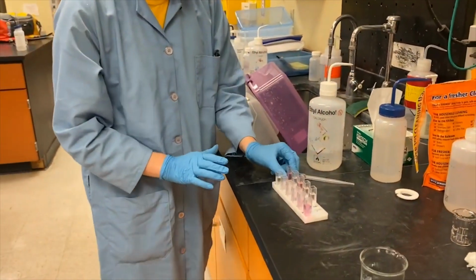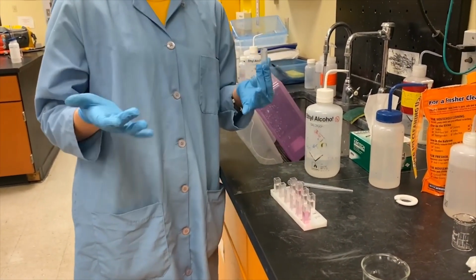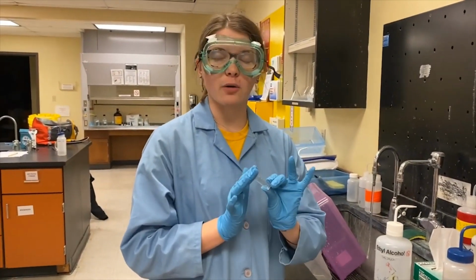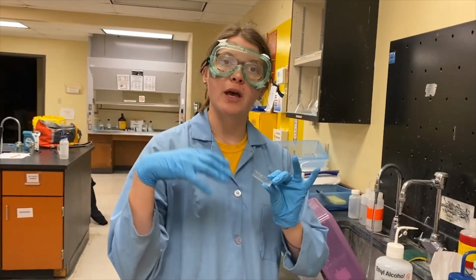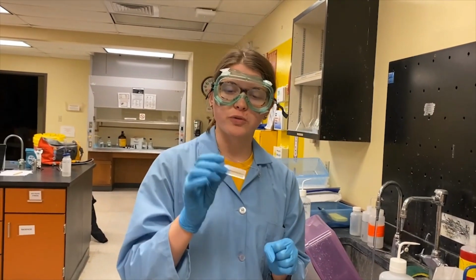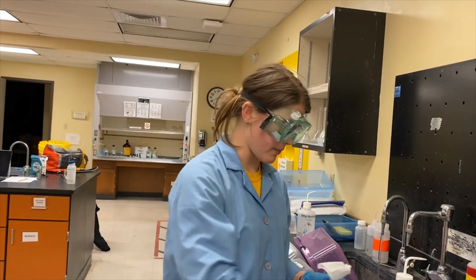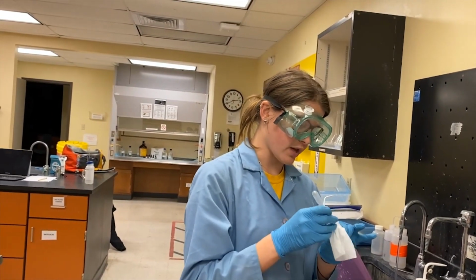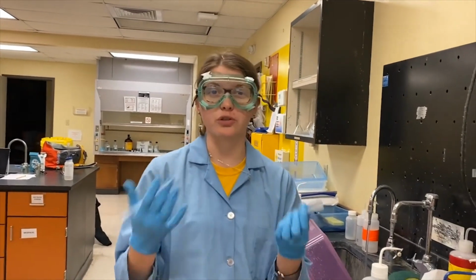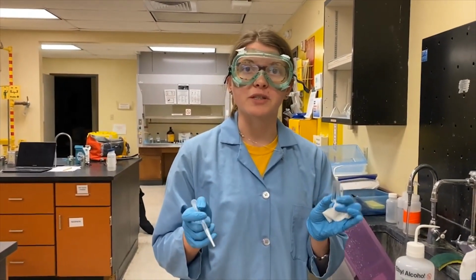With our cuvettes though, like we saw, sometimes they had Sharpie on them, and that's from past labs, but we do not want to clean these with our alcohol because this is plastic, and the alcohol-based solutions are going to craze or crack and essentially ruin the cuvettes. So to dry out the insides, we can use a Kim wipe and poke it down there with a pipette, or we can use the air blast from that little air thing that we've seen, which you'll learn when you finally get into a physical lab too. So that is essentially how we clean everything up today.